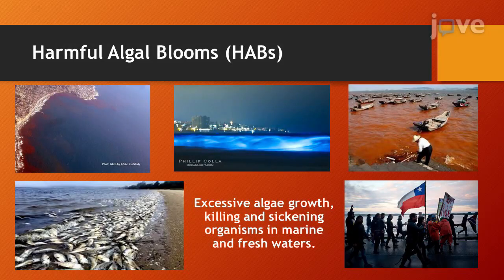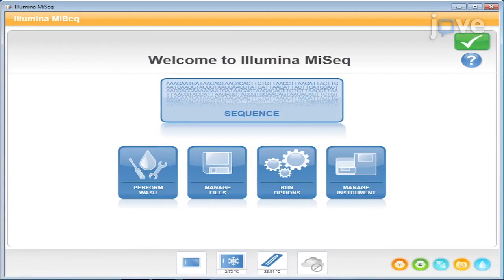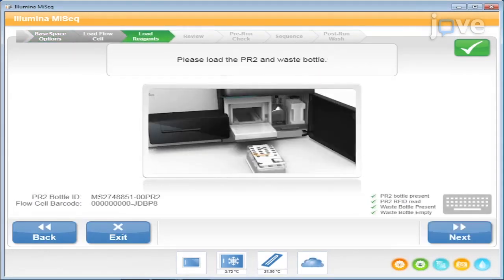This protocol presents insight into algal blooms and how to monitor toxic algal species effectively. The procedure helps provide an early warning of algal blooms to protect the community from associated damages. Metabarcoding analysis can detect many species in a sample at once, but it requires complicated procedures. This protocol visually explains each step to help minimize human errors during the analysis.